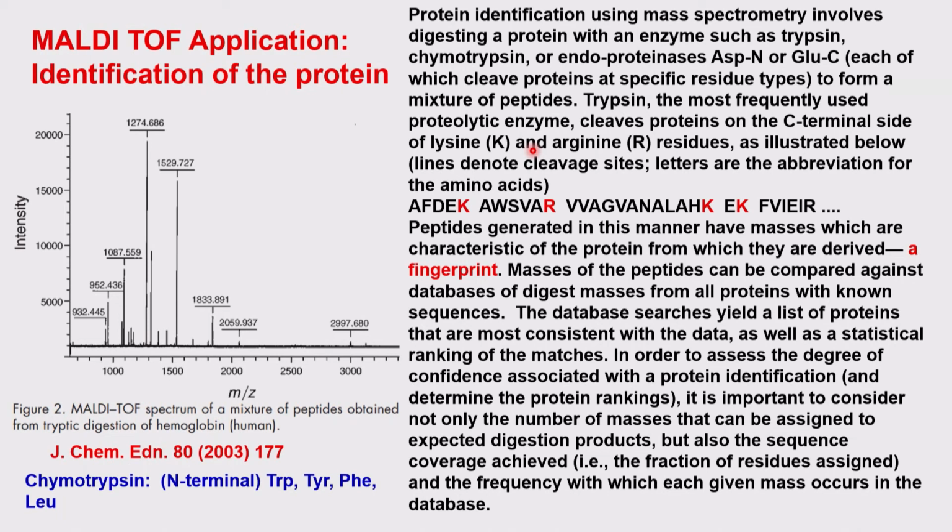Absolutely, you can perfectly make it. And in each given protein you can do the sequencing by doing a similar kind of thing. It's very well. So, you can find a protein in a mixture, and you can also do this particular amino acid sequencing as well.